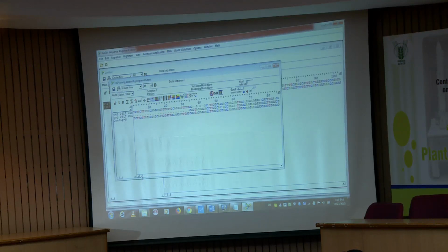If you just scroll towards the left, you can see there is a region that only forward has and a region that only reverse has, and can you see this extra region, because the central region will be overlapping in both sequences.